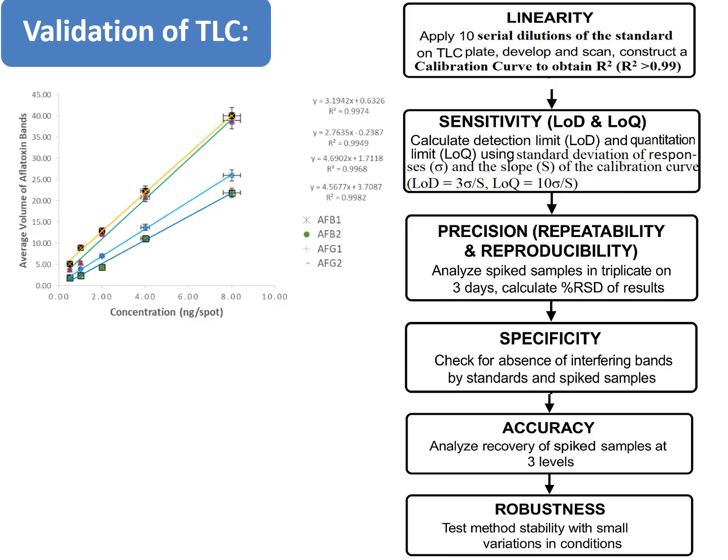That is, a standard or a known portion of the analyte is added into the sample, mixed together, and then analyzed at 3 different concentration levels, and then the recovery of the standard will now be measured from the artificially contaminated samples to obtain the accuracy.